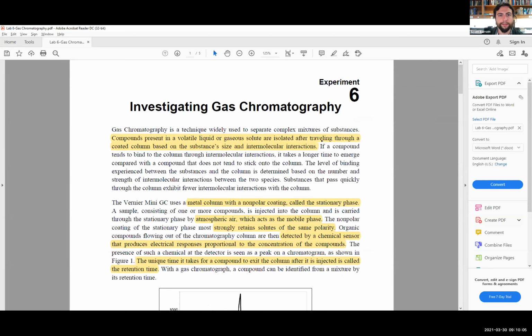Okay, so this week we'll be studying gas chromatography, and we're going to go forward to understand exactly what's going on. Firstly, it is another form of chromatography, if you will. In the way that we used something like silica gel to separate on column chromatography, in this situation we're going to be separating compounds using gas chromatography.